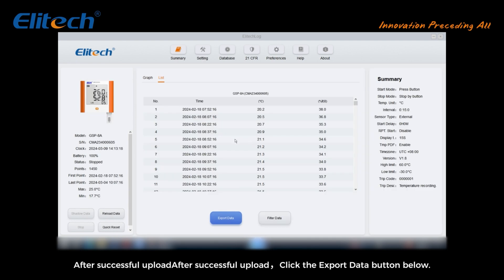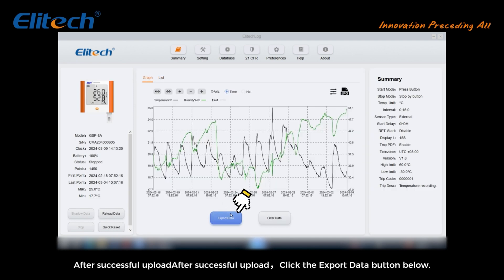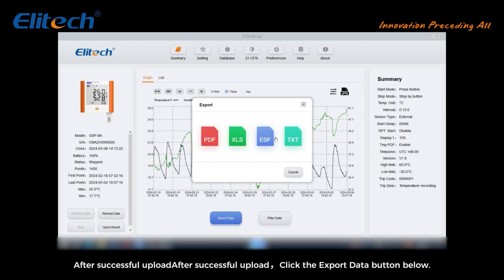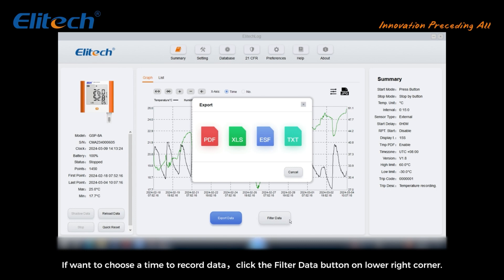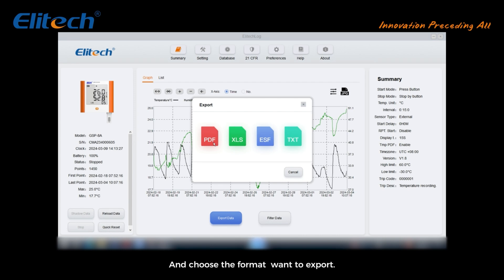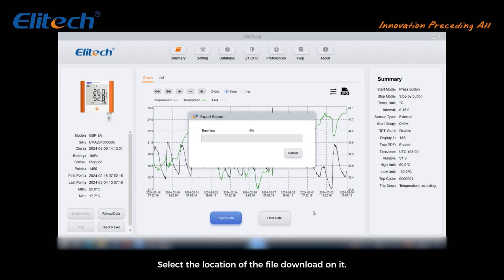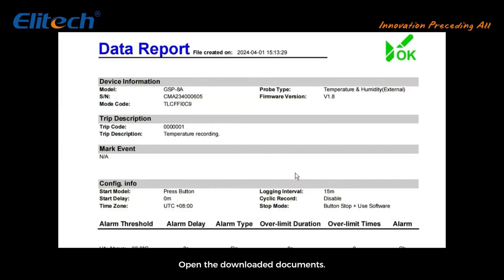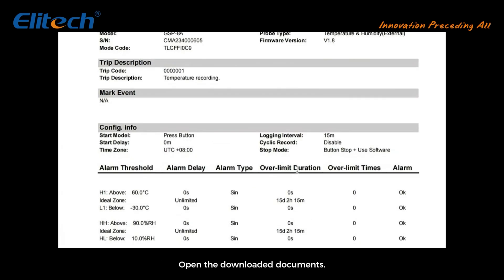After successful upload, click the export data button below. If you want to choose a time to record data, click the filter data button on the lower right corner and choose the format you want to export. Select the location of the file and download it.